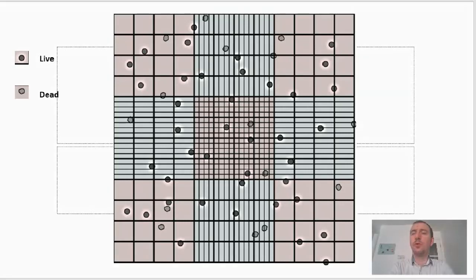Okay, at this point, we're going to proceed to watch a video which will give us an overview of how to use a hemocytometer to determine a cell count and also how to determine cell viability, both of which will be useful for the practical write-up.